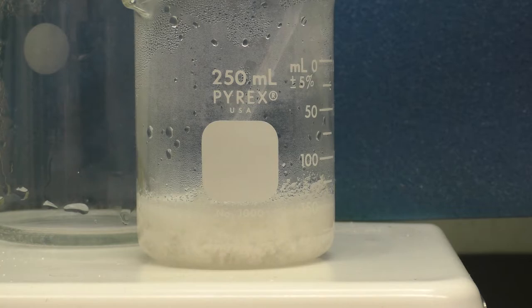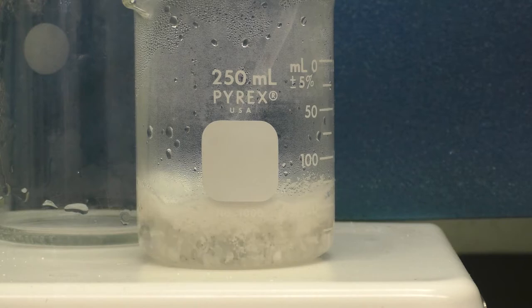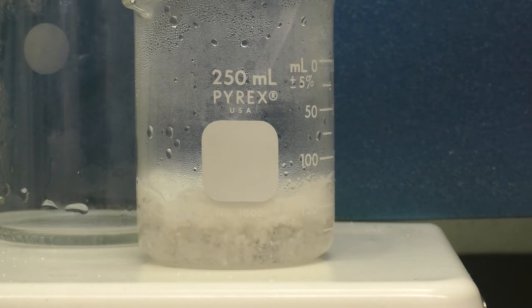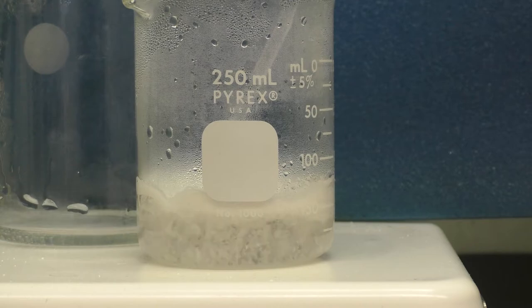Added quite a bit of water and the solution is boiling, but still not fully dissolving here. You can see some of that material dissolving. We'll definitely let that boil for a little bit, and see if we can get all of that material dissolved. If we can't, we'll probably just add the small amount of remaining water from the reservoir beaker. And if we need to, we can add more distilled water using just the water bottle.